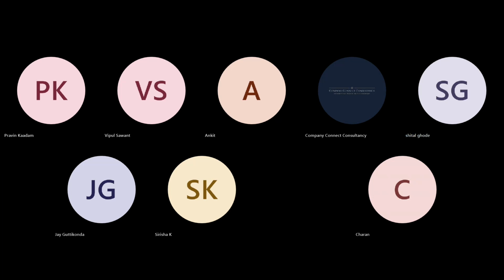But sir, we are using the logbook for entry. When we start the testing, at the same time we enter which type of product we are testing and which type of testing we have done right now.